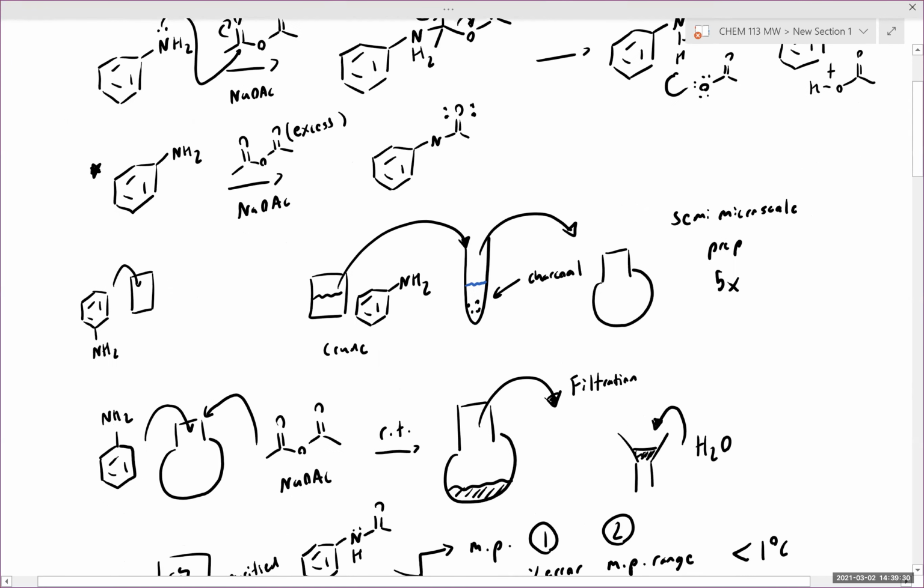Another thing I'd like you to add is that aniline has to typically be purified before use. This is a common characteristic of amines in that they can oxidize readily during storage. So as such, we take our quote unquote crude aniline solution and we purify it over activated charcoal before transferring our aniline solution into our reaction vessel. Activated charcoal is great for removing metal impurities and other colored impurities, and it's a common cleanup step used during filtration and treatment of your product.